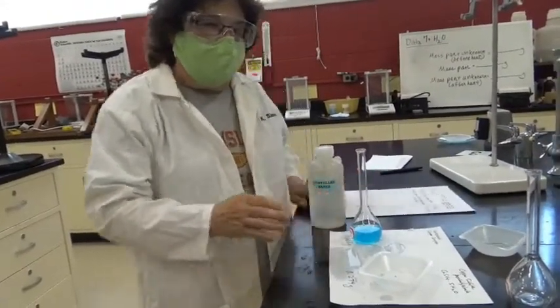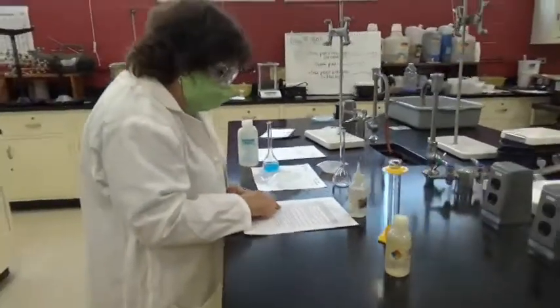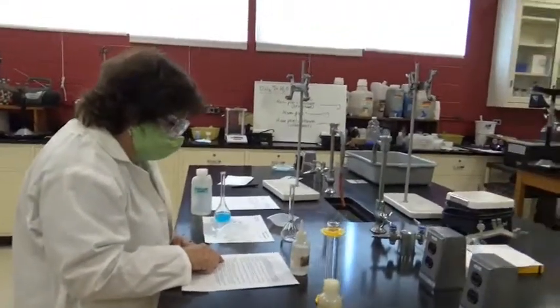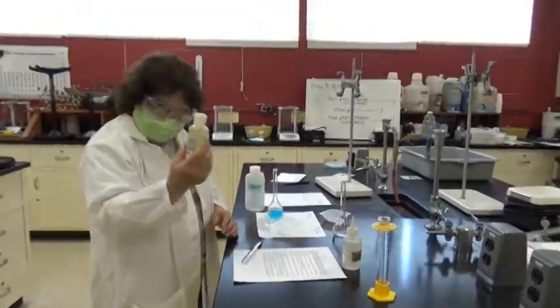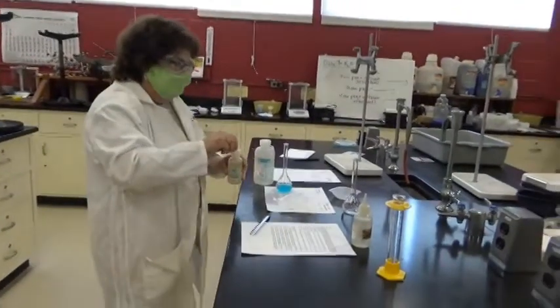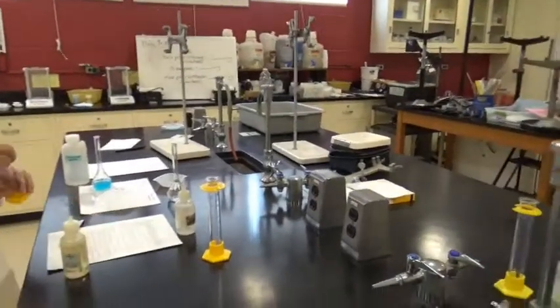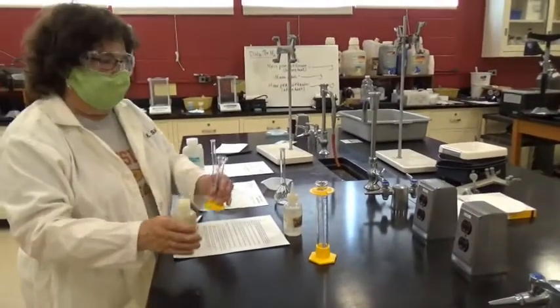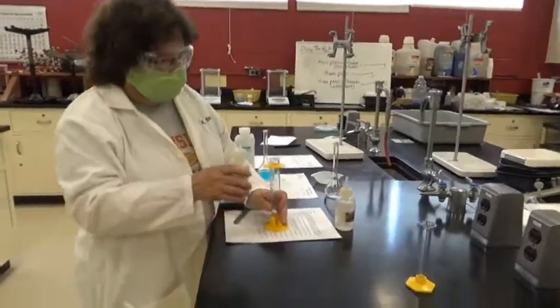And the other thing I have to add to this, according to the directions here, it says to add 15 milliliters of a 6 molar ammonia solution. Again, read your bottle. This says NH3 ammonia, 15 milliliters. So I need a small, oh, just use this one. I rinsed it. Okay, great. So I can get 15 milliliters in here.